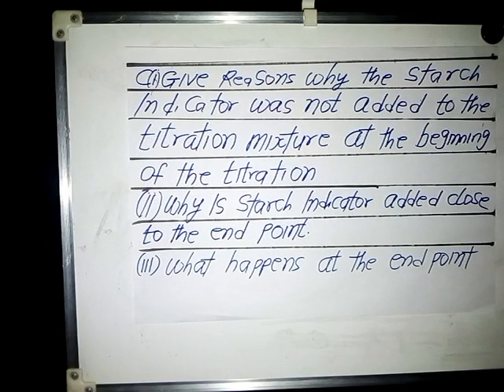Then I might want to add another one, just in case you're asked, why does starch solution have to be freshly prepared? It is because it deteriorates quickly on standing. If you're asked why starch solution has to be freshly prepared, the reason is that it deteriorates quickly on standing.